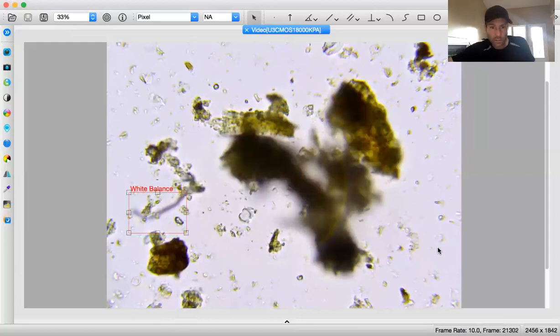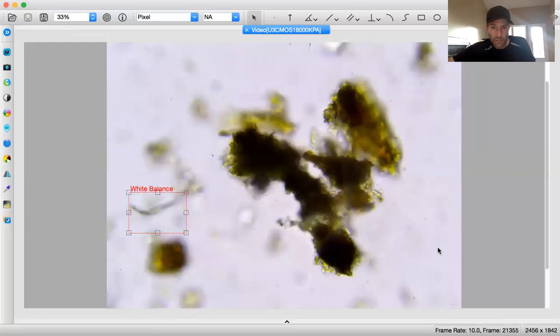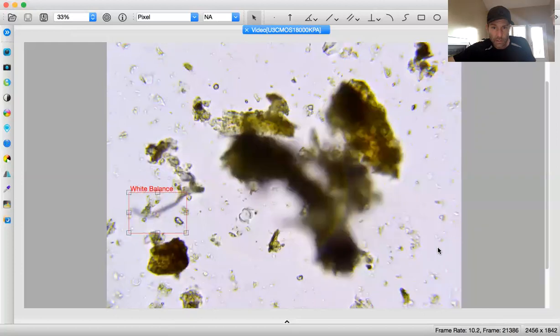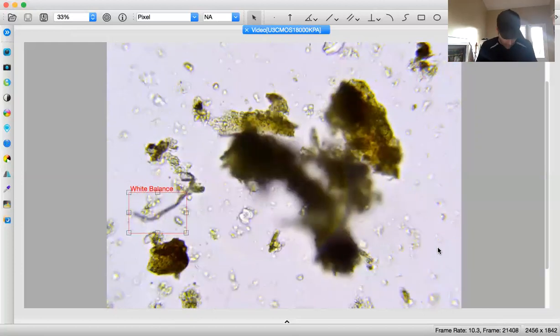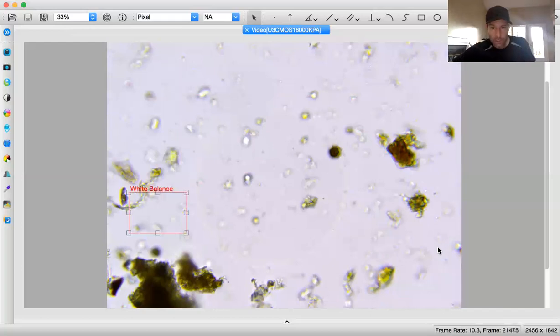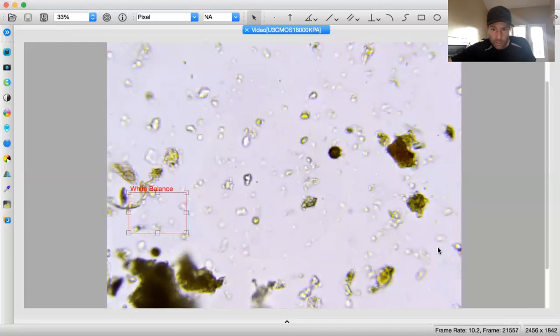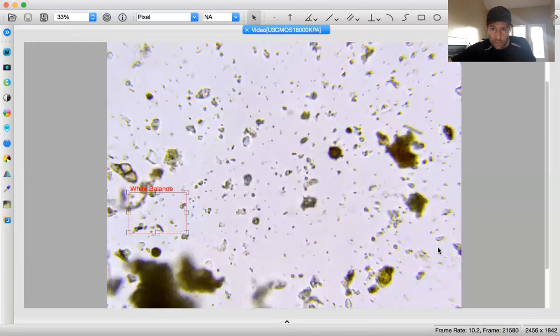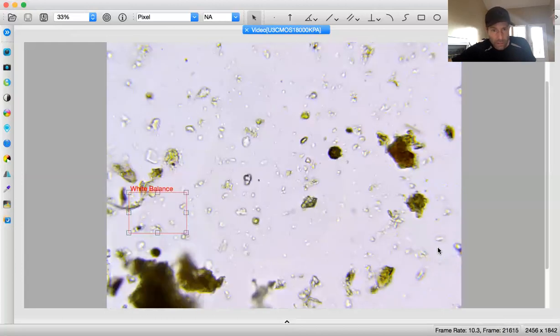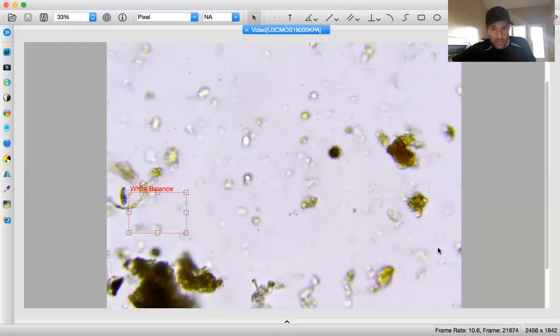I just want to make sure, go to the top of the frame. Make sure I didn't miss anything that's in the aggregation here of the organic matter. I don't see anything, so I'm going to move on at this point. Make sure I have my information. Yes. So number 3, ta-da. No protozoa off the bat. Ooh, what is that? What is that? What? Oh, I couldn't see it. It looked like a flagellate, but I can't tell, it was going so fast.